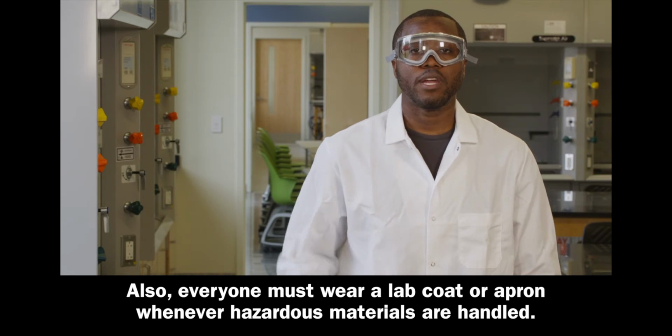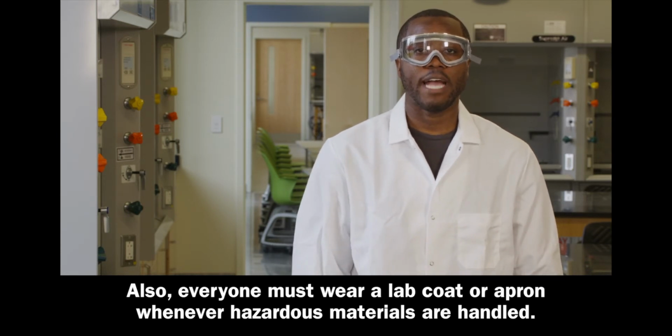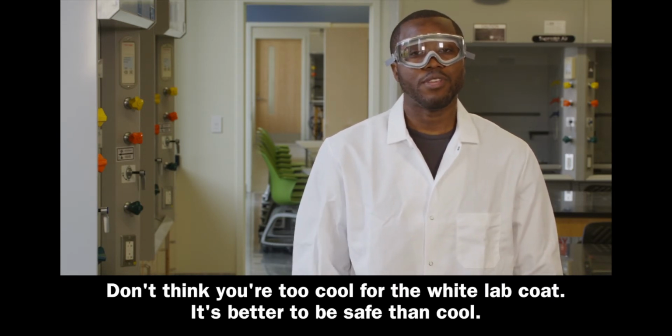Also, everyone must wear a lab coat or apron whenever hazardous materials are handled. Don't think you're too cool for the white lab coat. It's better to be safe than cool.